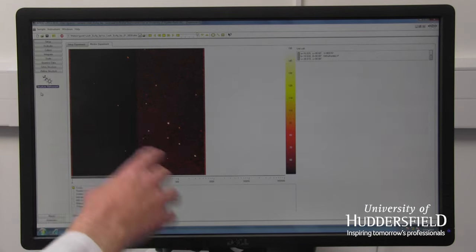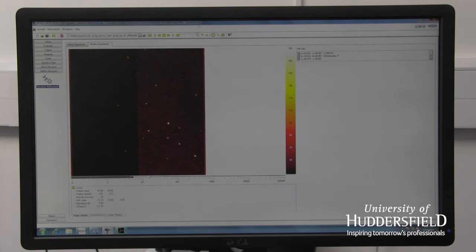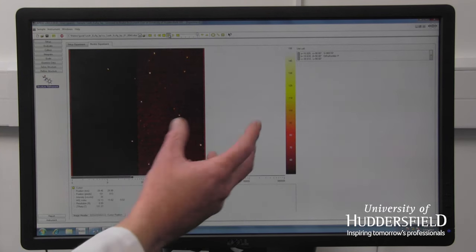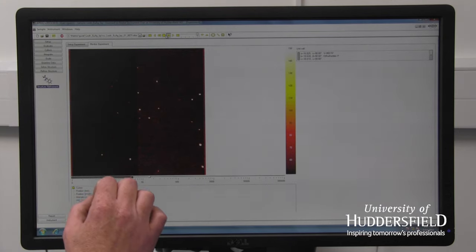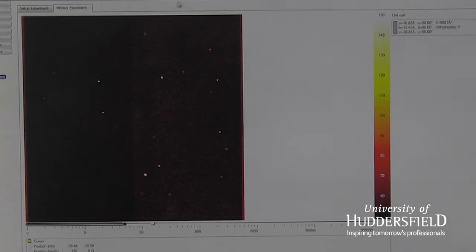But you don't just get one picture, you get many. We get thousands and thousands of images. Image after image. What we're doing is we're rotating the crystal, taking a picture, rotating the crystal, and taking the picture. And we're getting this pattern here.